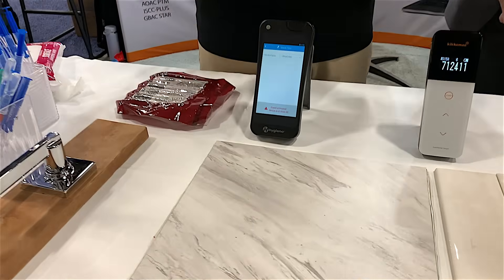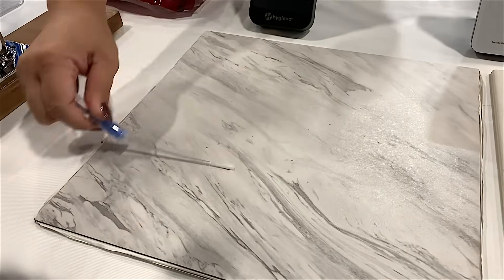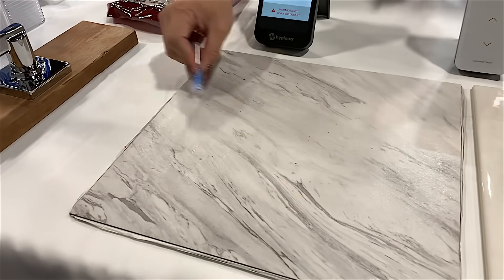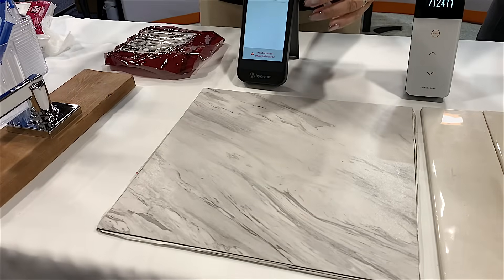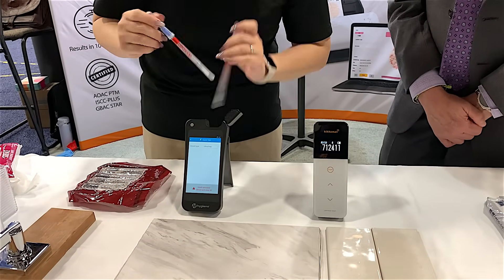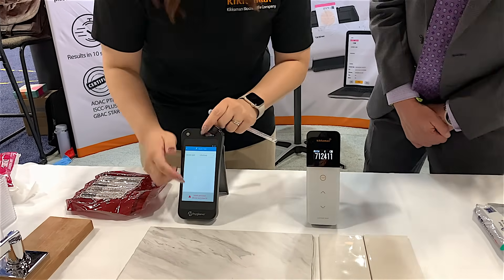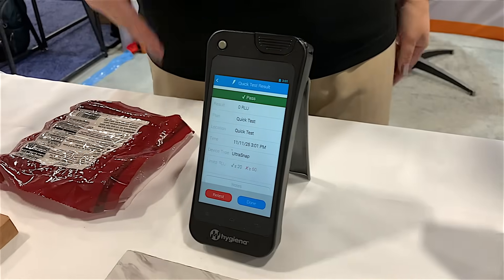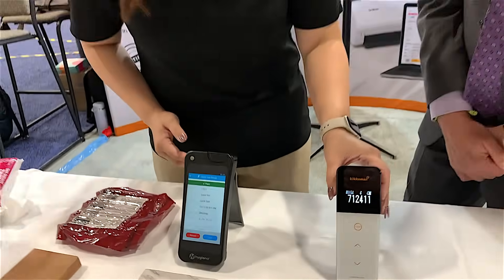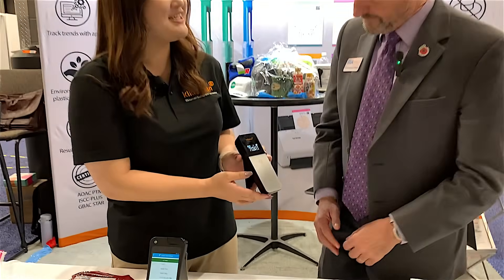So now I'm going to bring in the conventional ATP test — this is just detecting ATP. I'll collect the samples the same way: good enough pressure, side by side, rotate, push it inside, snap, and mix. So this appears at zero, even though there was a lot of sausage grease on the surface. For the LumiTester Smart, it was able to give you an actual number of how dirty the surface was. Gavin, what would you say about this number?